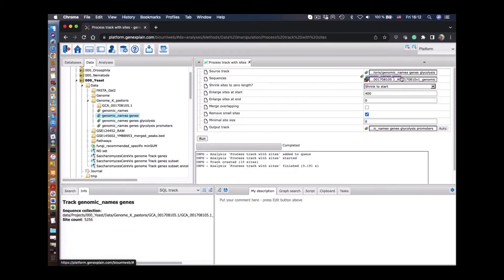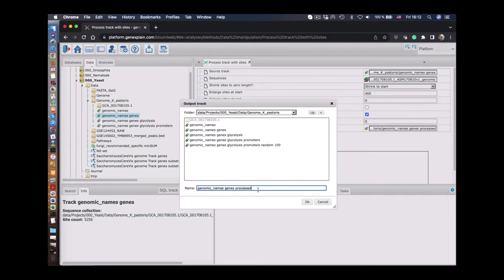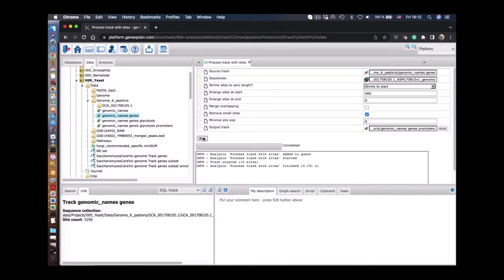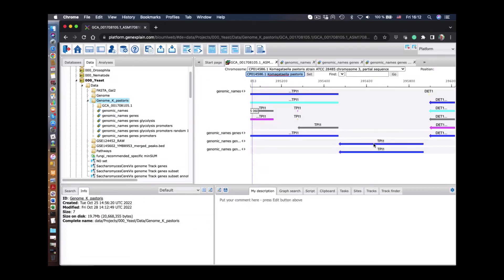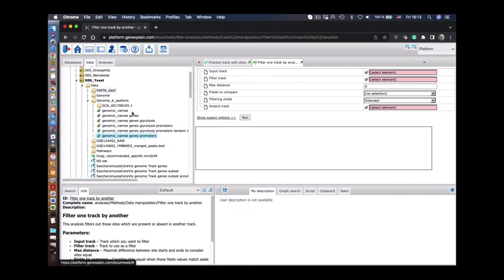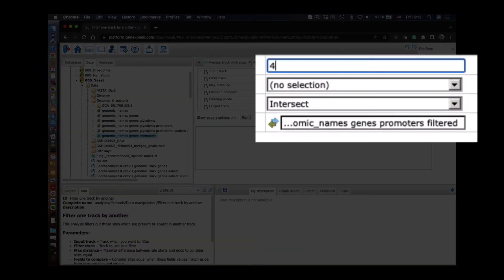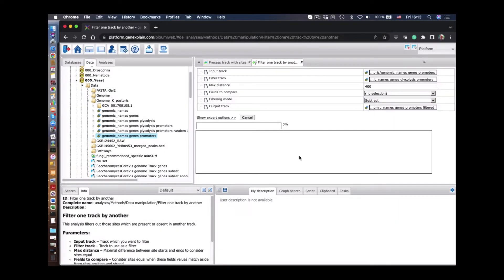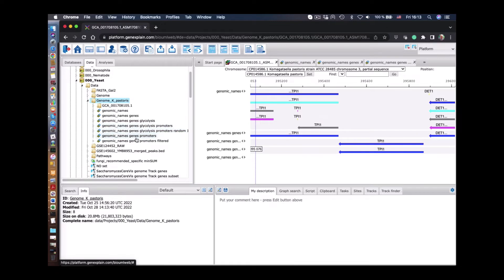The same we will do for all the genes in this genome — all 5,000 genes. We create a promoter track for all genes, and this track contains promoters of length 100 nucleotides. Now we want to create a track which has all genes but excludes the glycolysis genes. We intersect these two tracks and subtract the promoters of glycolysis genes from all other promoters. Now we have this background track.